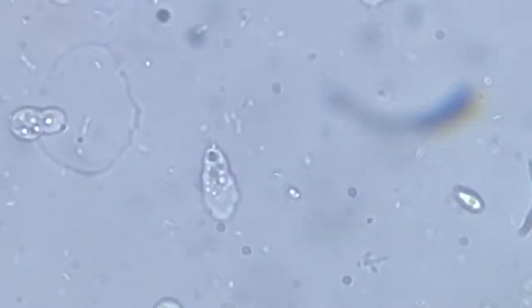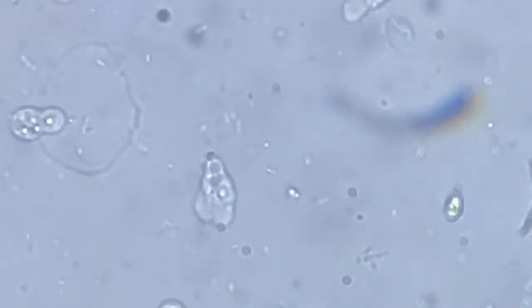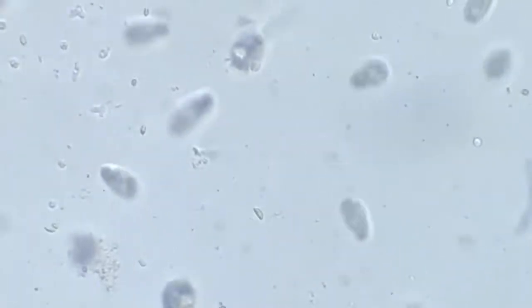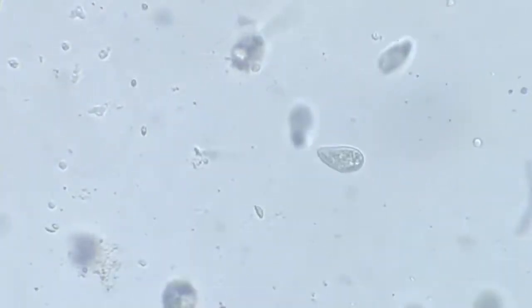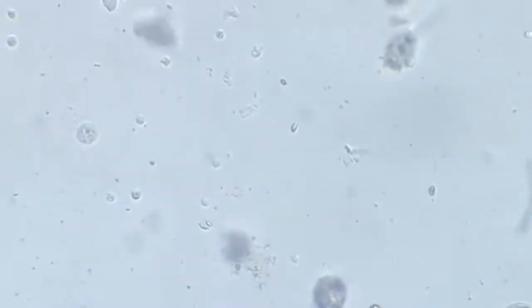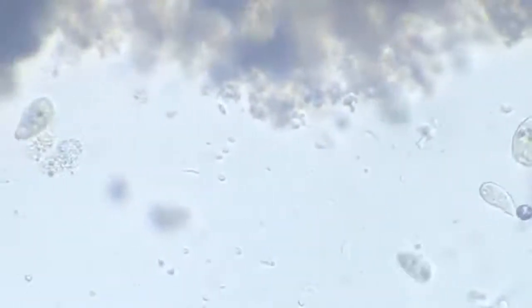So we are already 20 minutes into this streaming, and we have seen a few interesting individuals around. We saw some ciliates. Now you see the amoeba, they are very well scattered around. So many have come out.